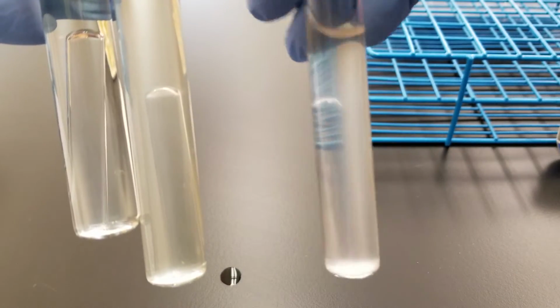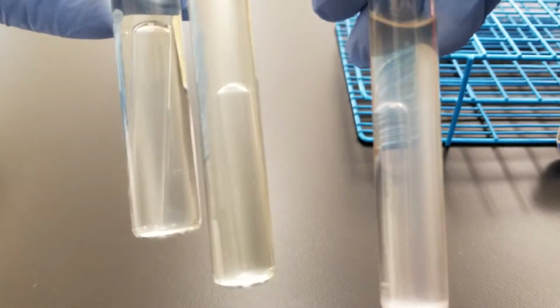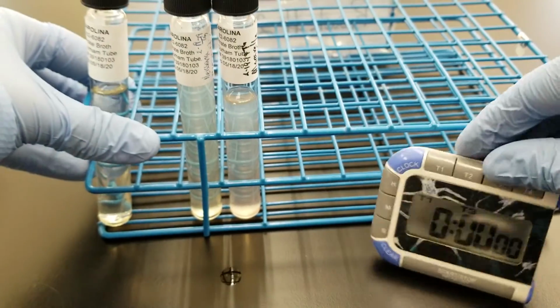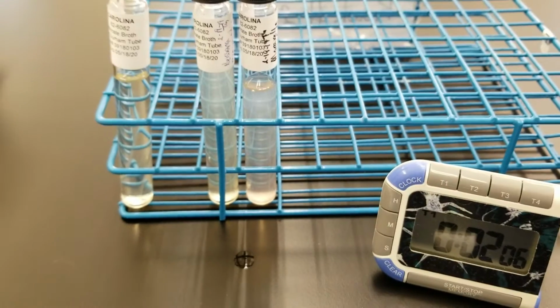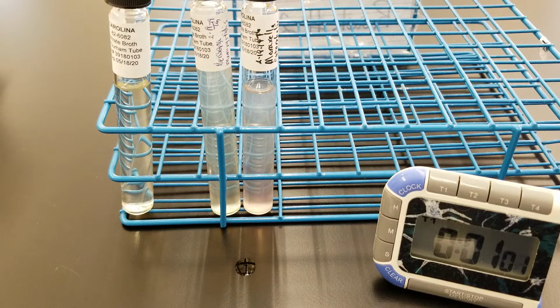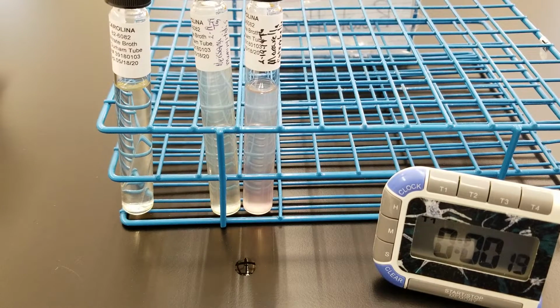On the camera, it looks like this one's turning pinkish. In real life, I can't really tell. Oh, there it goes. It looks like it's starting. All right, I'm going to let them sit. As it's going, I'll do that off camera and then come back. Okay, this is after 2 minutes so far. We can see this turning pink visibly, and I'll keep letting it go for the rest of the minute and I'll come back. All right, so we're in the final countdown.